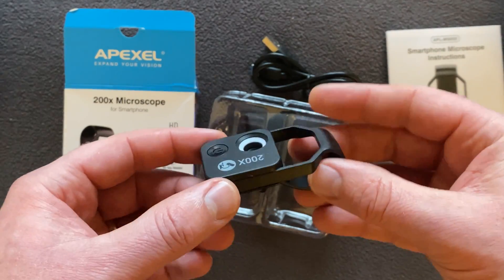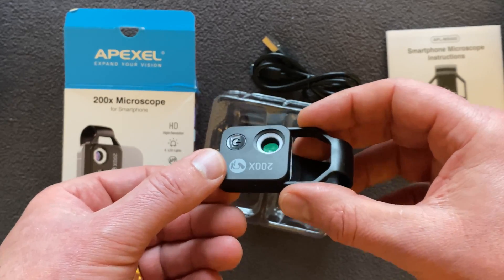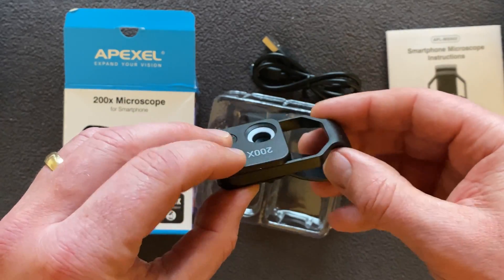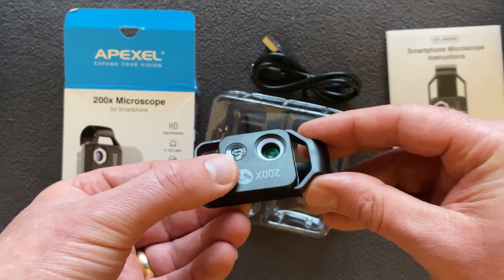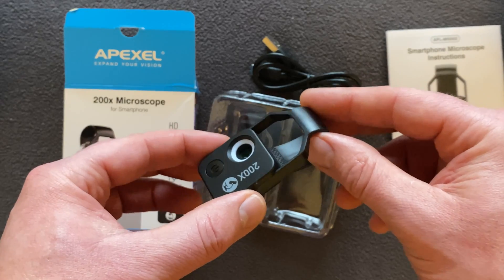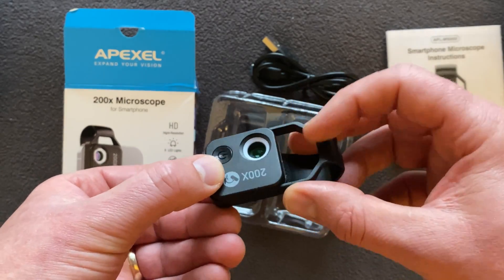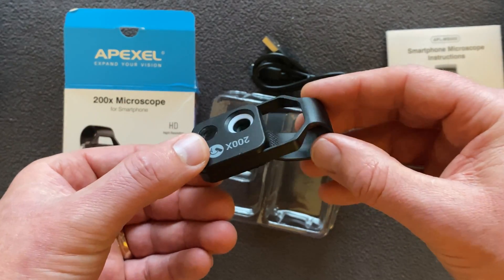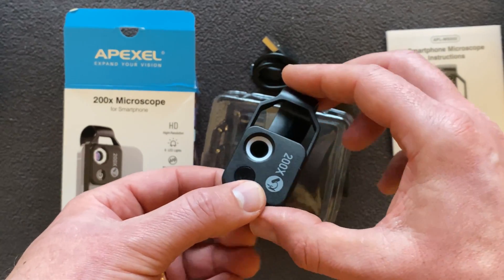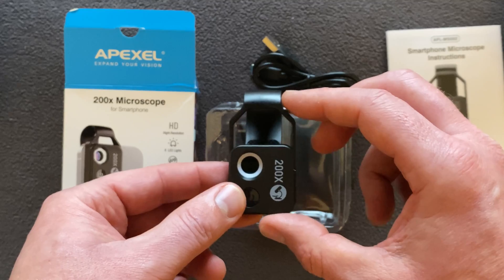I should also mention the build quality. The macro lens I reviewed the other week was aluminium, but this is a plastic body and the housing for it is all plastic as well. It does feel very durable, actually. It's a shame there's no aluminium, because aluminium really gives you reassurance of a quality build. It's obviously very delicate and you have to be careful with it, but it feels pretty rigid. I'll give a further review once I start to use it.